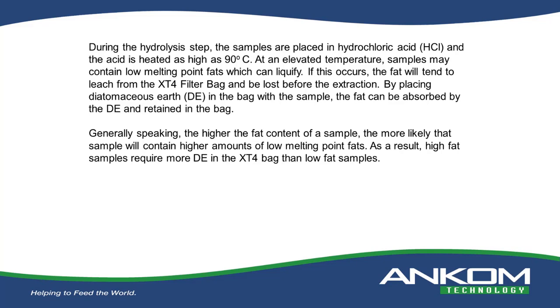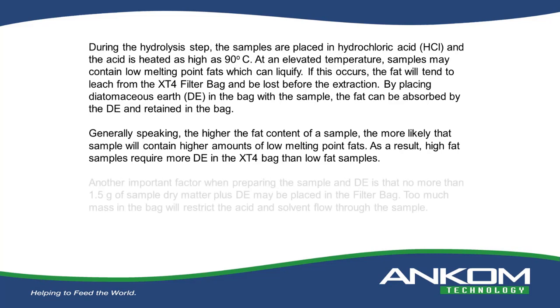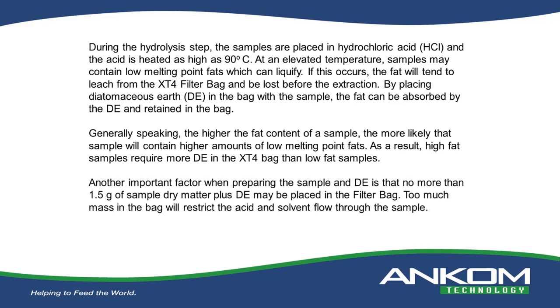Generally speaking, the higher the fat content of a sample, the more likely that sample will contain higher amounts of low melting point fats. As a result, high fat samples require more DE in the XT4 bag than do low fat samples. Another important factor when preparing the sample and DE is that no more than 1.5 grams of sample dry matter plus DE may be placed in the filter bag.